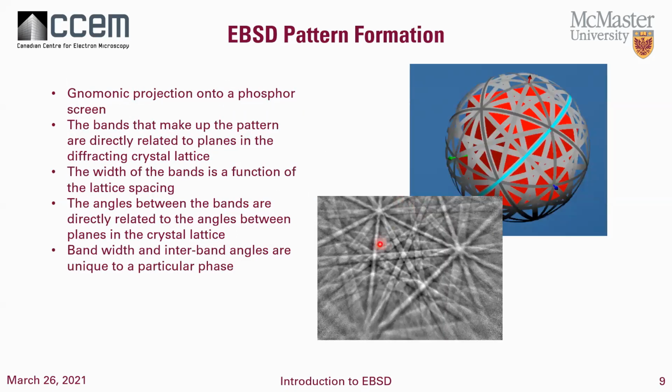So if we're actually looking at what we get on the screen, we get an image, which is basically like a globe, a spherical projection onto a two-dimensional surface. So in this case, you can see that towards the outer edge, it's a little more blurry because we are a little further away and we're not getting quite optimum collection from the edges of things.